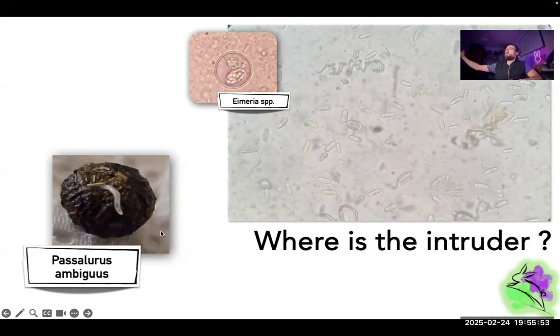For example, when you're going for vaccination or for the routine health check every 6 months, also if you don't see any parasites, because sometimes they can be there without causing any problem. And I can say the same for the coccidia. Coccidia can be life-threatening in young rabbits because they can cause a lot of problems and damage in the gastrointestinal tract. But usually adult rabbits can also have them without showing any signs. And a fecal test, again, could be very, very useful to detect if they're present or not.